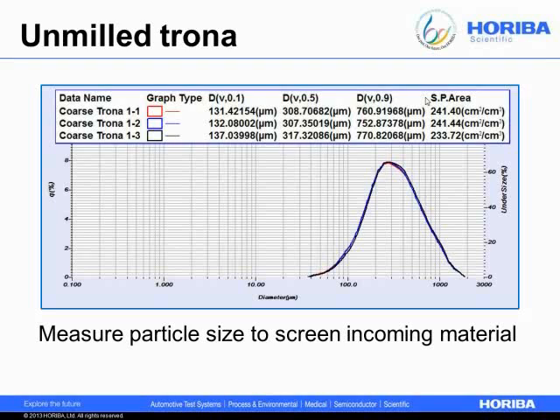So it assumes that it's a hard sphere, and because it assumes that, as long as we know the volume and the size, which we do because we get this result, we can calculate the specific surface area with the assumption that it's a hard sphere. So it's not a particularly accurate surface area because, again, we know that Trona before it's injected has a very low surface area because it's non-porous. And Trona after it's injected has a much higher surface area, but what is generally true, as we'll see in the next few slides, is that as the size reduces, the specific surface area increases.